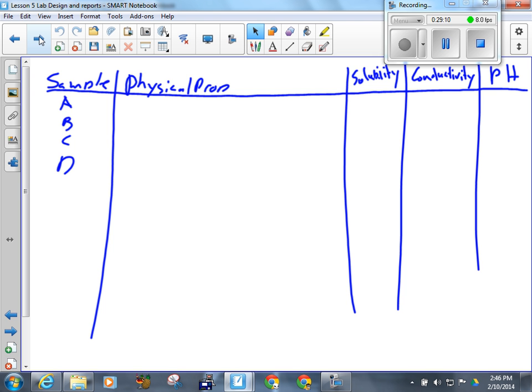I mean, we've got lab aprons, but they don't cover everything. And we have lab goggles. Obviously, they're not stylish by any stretch, but they work really well at keeping your eyes safe. Okay, all right, back to work.